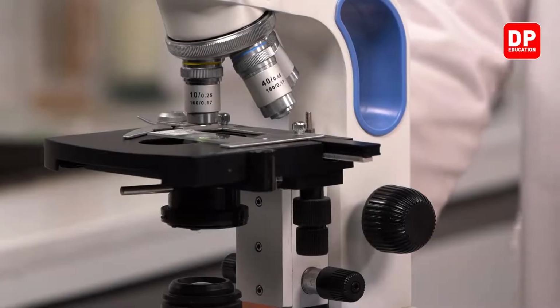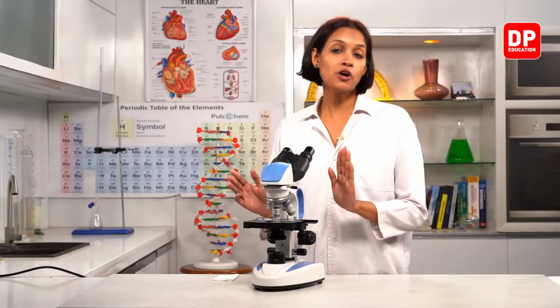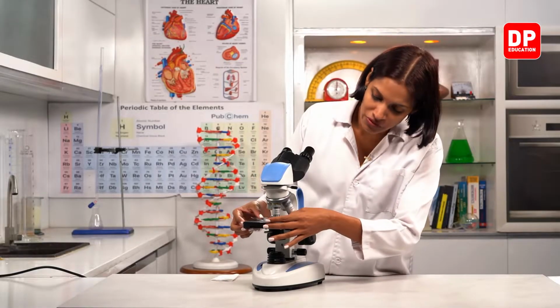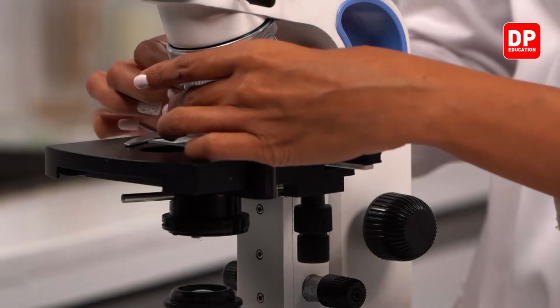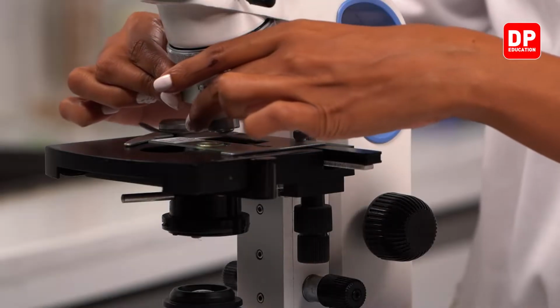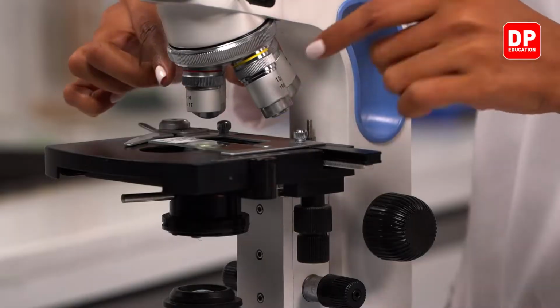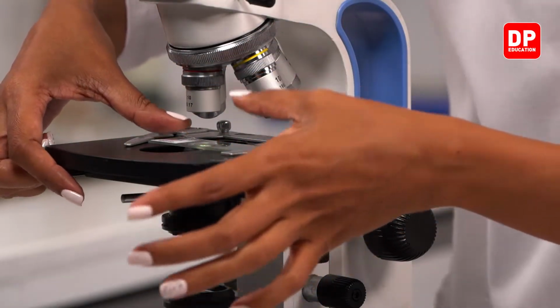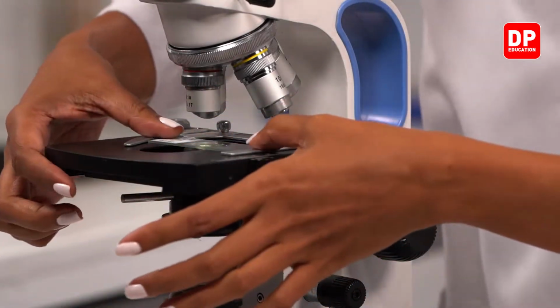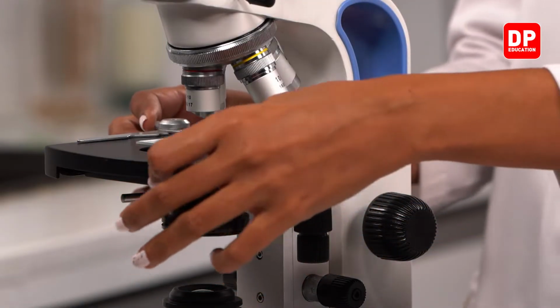Right, children? So after observing, what do we have to do, children? Now we need to remove this slide, okay? Now what is the next step? Are we going to remove it like this? No, because this is not the lowest power. As I told you all, for the protection of the microscope, we need to put it back to the low power. Right? See, it is very short, and because of that, when we take this slide away from the stage, we will not harm the lens, okay? So I am going to take it out.